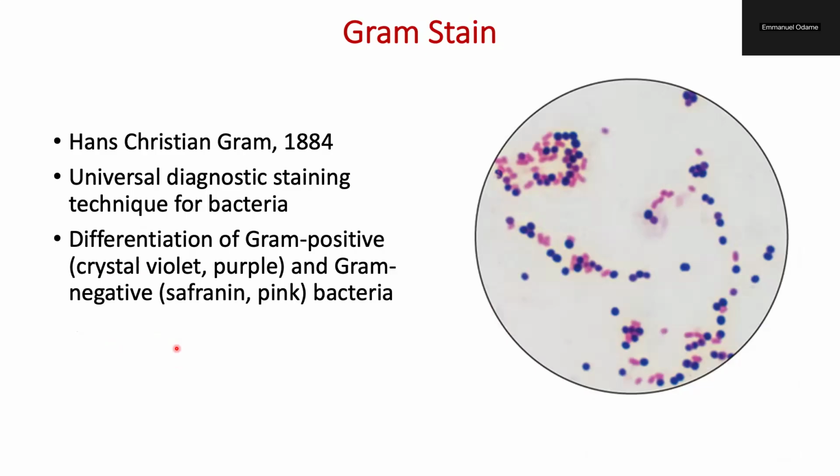Sorry, that forms endospores. So let's talk of Gram stain. Gram staining was discovered by Hans Christian Gram in 1884, and it is basically a universal diagnostic staining technique for bacteria.